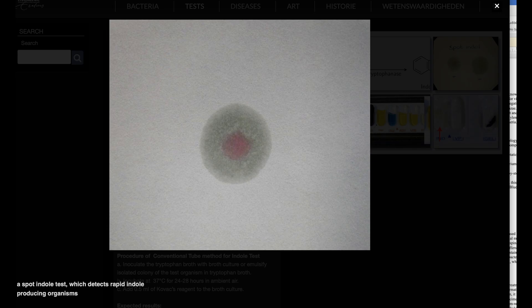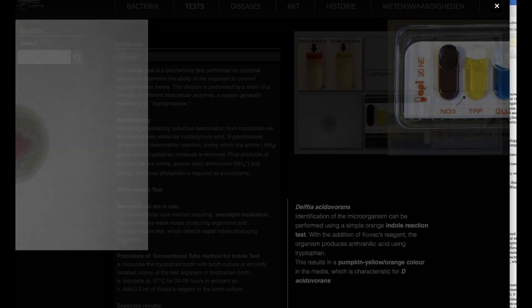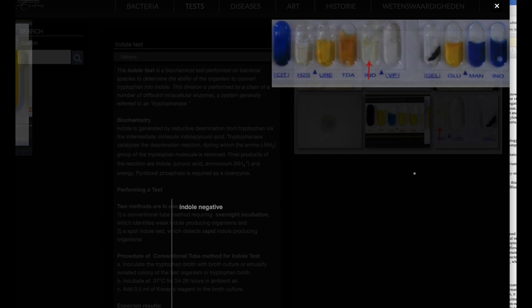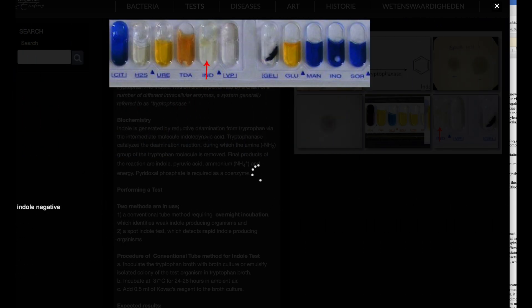Expected results indole test. Positive: A pink color ring forms after adding the reagent. Negative: No color change occurs even after adding the reagent. For example, Klebsiella pneumoniae.